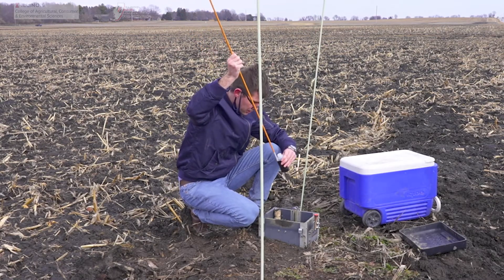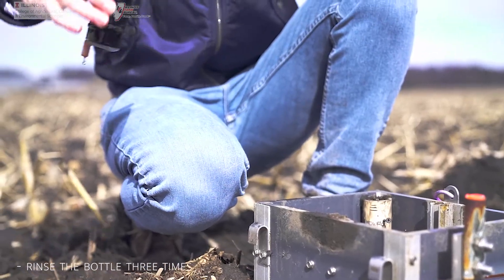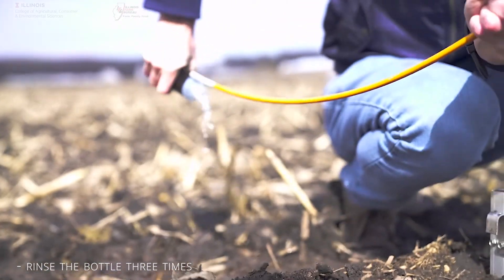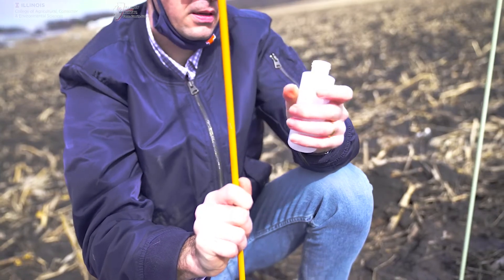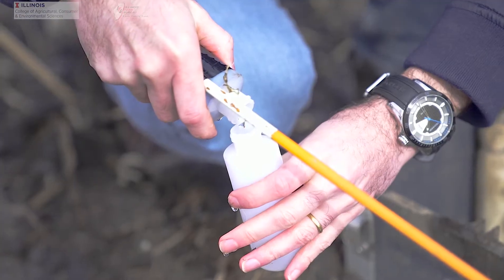Make sure the bottle is clean and secure. Stick it down to the water and rinse the bottle three times. This ensures that the water being collected is truly representative of what is flowing through that control structure. Pour the fourth filling of the bottle into your pre-labeled sample collection bottle, checking the label first carefully.